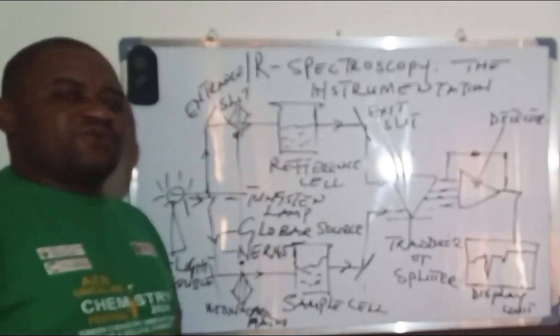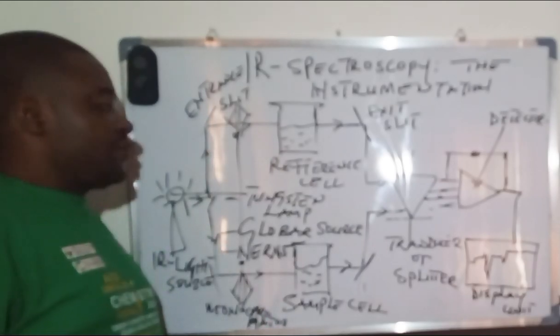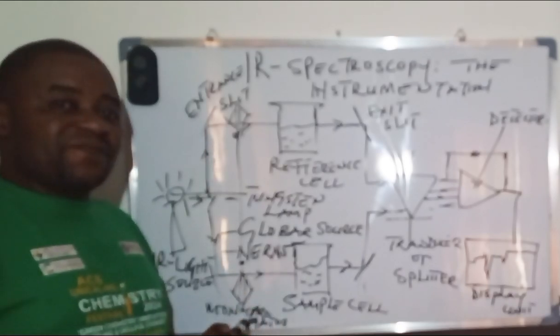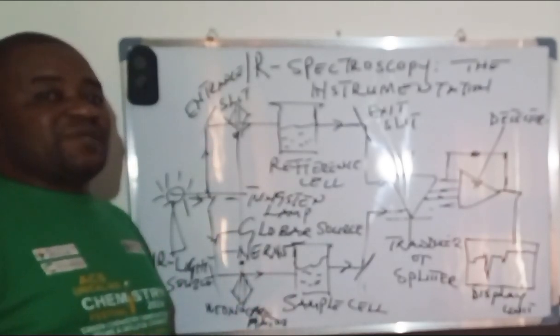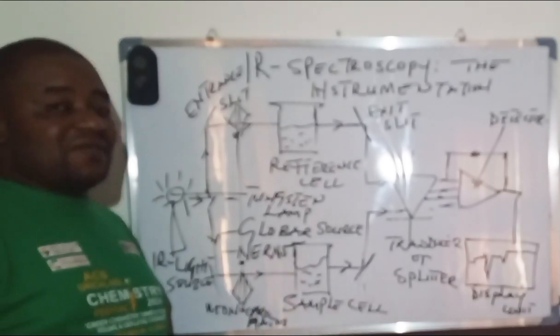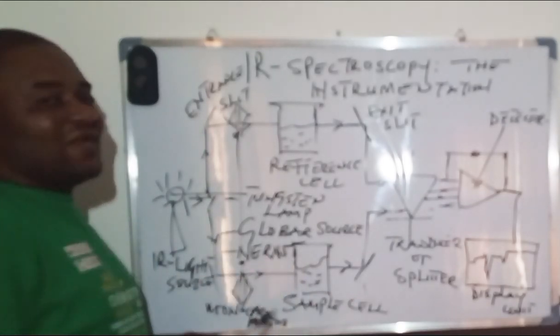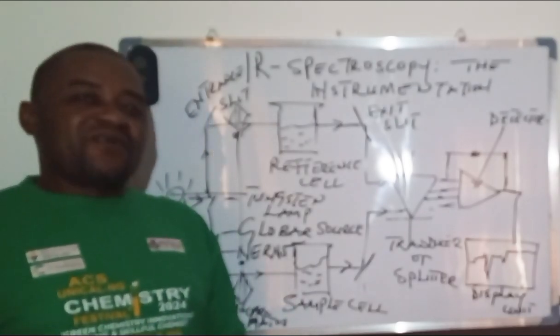So if they have that particular strong tendency of absorbing IR radiations, if you use them for your sample, it will not only be your sample that is doing what? Absorbing the IR radiations. Also, the monochromators are also absorbing. In that case, you cannot be able to tell the exact radiations that are transmitted at the end of the day because of the intense absorption. So usually we don't advise that quartz or glass we use for prism preparation.